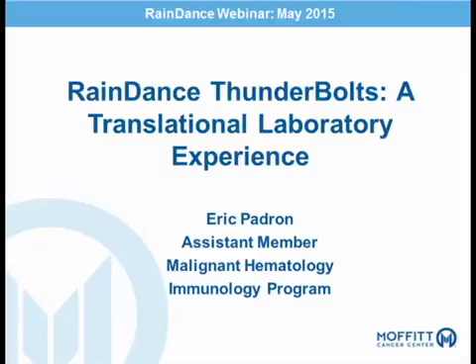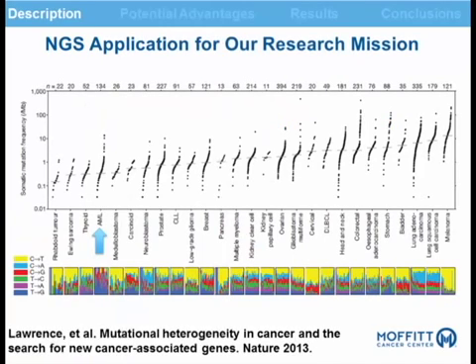We have a great bioinformatics collaboration, but we, at the heart, are not bioinformaticians. What we are is an NGS, or I like to think we are, an NGS-savvy lab. We recognize the importance of using these types of panels in the disease we study, which I'll get into in a second. And many, if not all, of our assays in our laboratory converge on target enrichment sequencing. With that framework, I'd like to give you a brief overview of our pilot experience using the Thunderbolt panel.